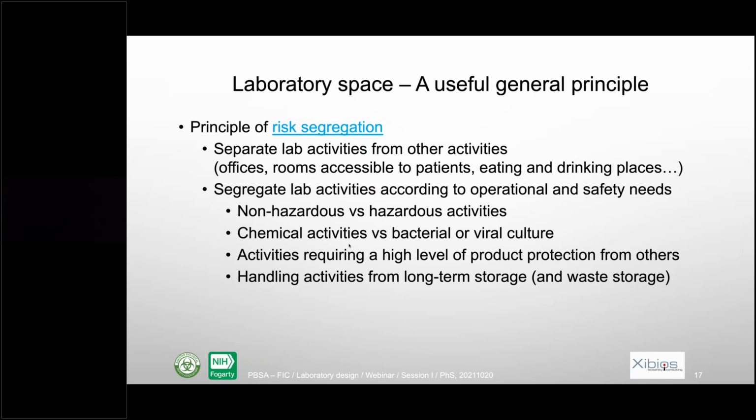But then you could go further into segregation, separating some activities according to their nature in order to facilitate operation and to facilitate risk control. For instance, you could separate hazardous from non-hazardous activities.